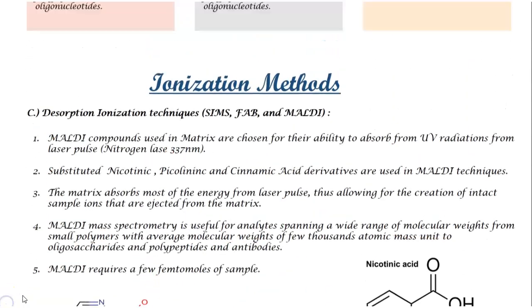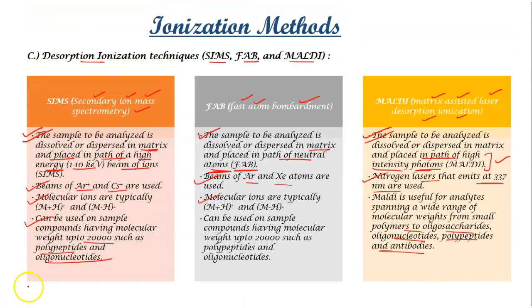In the next slide, we'll be taking the last ionization technique. We'll be discussing that in detail, and that is your electrospray ionization technique.